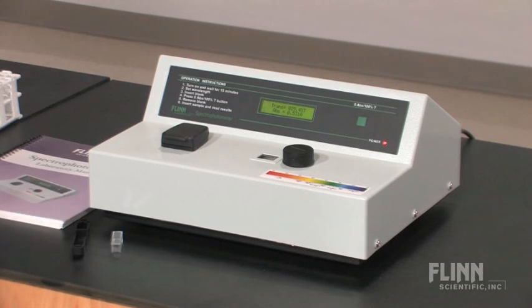This Flinn Scientific spectrophotometer really is everything you need in your classroom at a price that you can afford.